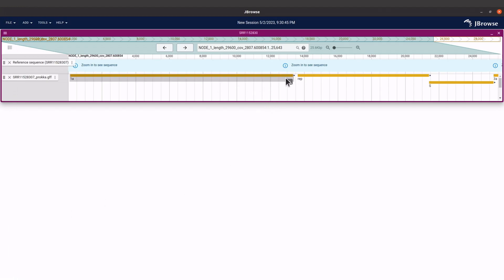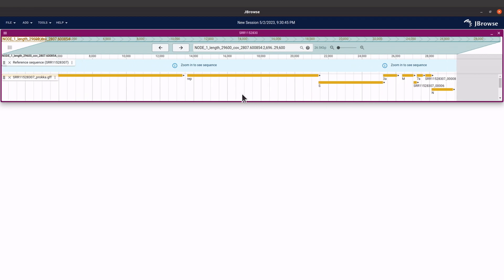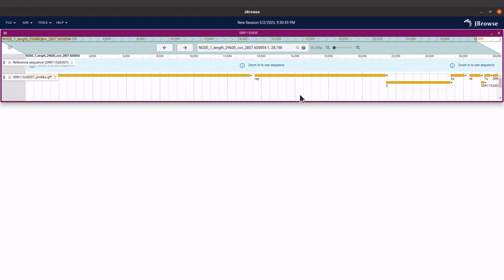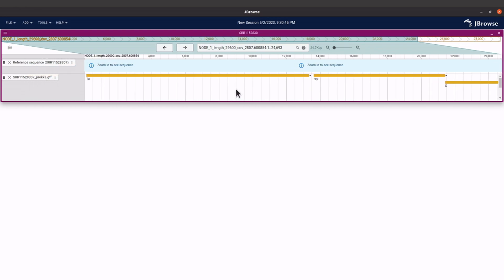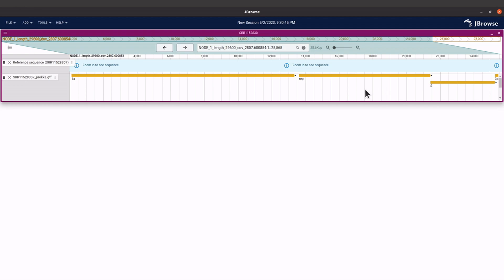Let's confirm — let's get back to our JBrowse window. You can check the arrows: this is one, this is one, you can also see one here. We see all of them are pointing to the same direction. That is what that statement was referring to — because we are dealing with an RNA virus which is single-stranded, that is why we should see that all the arrows are pointing to the same direction. So what we have here is good.